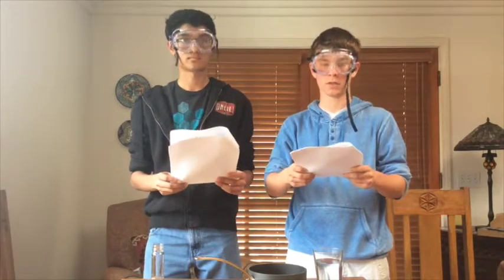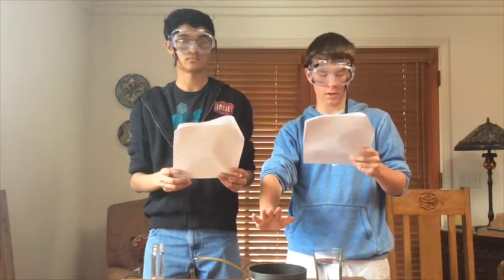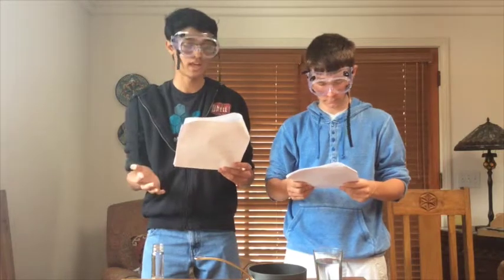You can burn yourself badly if you unknowingly touch something that's hot. Instead, hold your hand close enough to the object that you can sense whether it's hot or cold. If you or a classmate burn yourself, alert a fellow classmate, or better yet, the teacher. Proceed to apply cool water to the site of the burn. If we all follow the safety instructions, however, there will be no need for an emergency protocol.